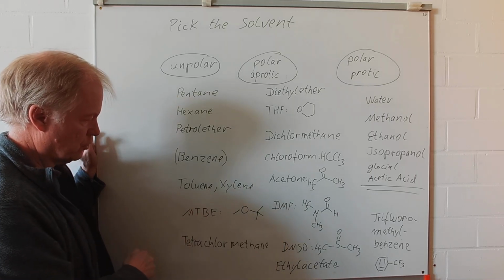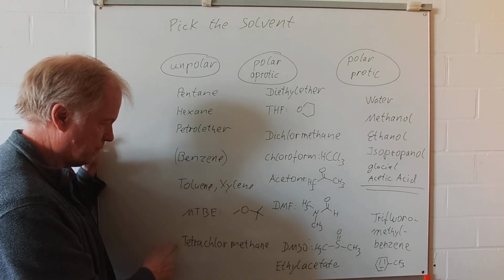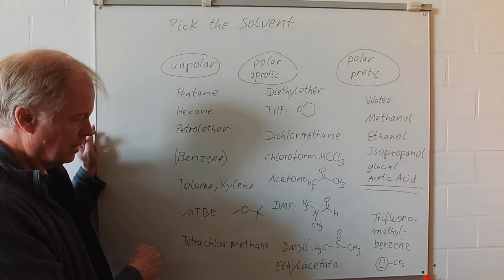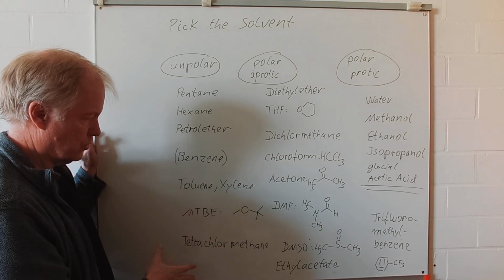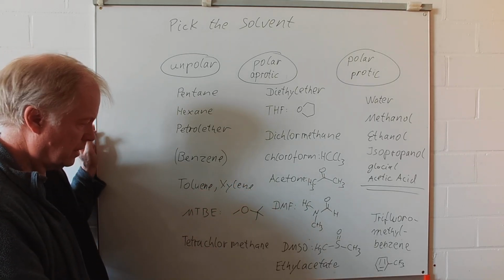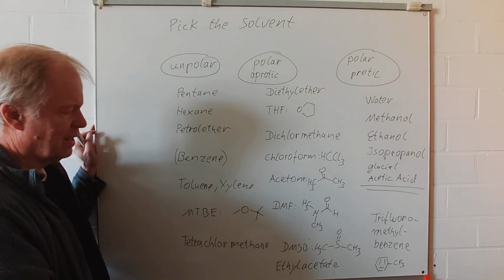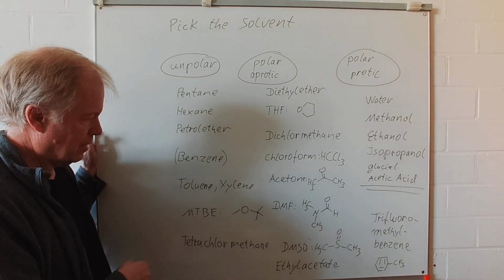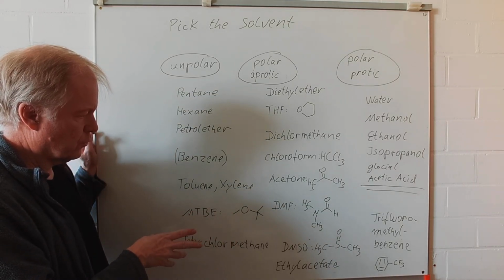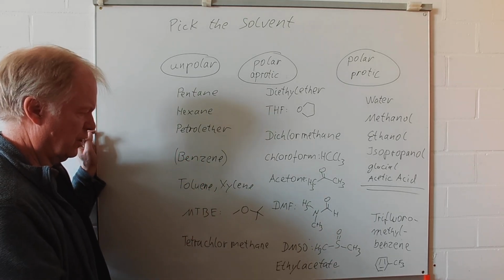An interesting solvent is methyl tertiary butyl ether, MTBE. It is produced in large amount within the petrol industry. We can try to use that. We have in my lab already tried to use it for radical reaction. It worked okay.